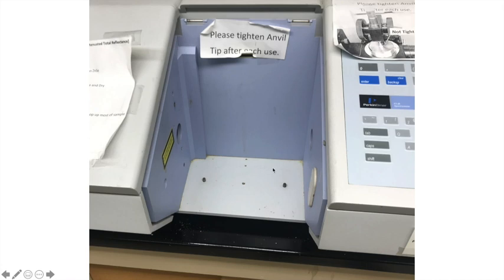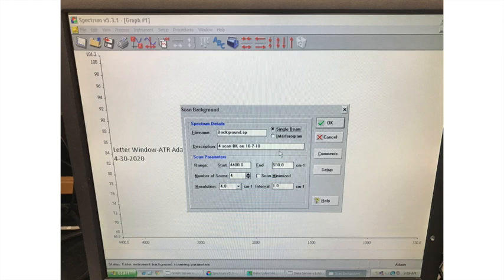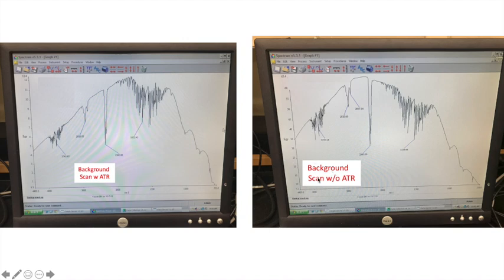And when you do this, you have to redo a background scan because now you're not going through zinc selenide crystals. You're just going through the air and whatever's in the inside of the machine. So I redid that. This is the background scan with the ATR adapter. That's the background scan from earlier. And you'll see the energy value here goes to 12.4. And now here is the background after I've taken the ATR adapter out. And now you can see it's absorbing, it's getting a lot stronger signals. The energy is up at 60. So yeah, when you don't have the ATR adapter in there, you get better spectra, but only slightly better. So the ATR adapter is totally worth it.